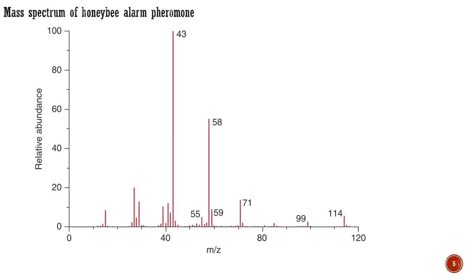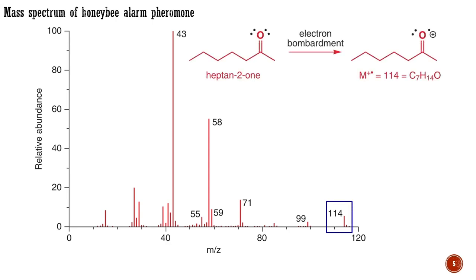A typical electron impact mass spectrum looks like this. This compound was identified as a pheromone deposited by worker bees when feeding, as a marker to deter their colleagues from visiting the same, now depleted, nectar source. Only minute quantities are available for analysis, but that does not matter — mass spectrometry is successful even on a microgram scale. The spectrum indicates that the molecule has a mass of 114 because that is the highest mass observed. The molecule is in fact the volatile ketone heptanone, alternatively known as honeybee alarm pheromone.